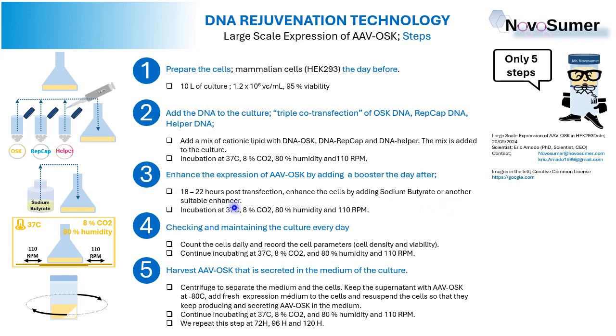There are many enhancers that you can use, and we keep on incubating at 37 Celsius degrees, 8% of CO2, 80% of humidity, and 110 RPMs. So this third step is just the addition of a booster.